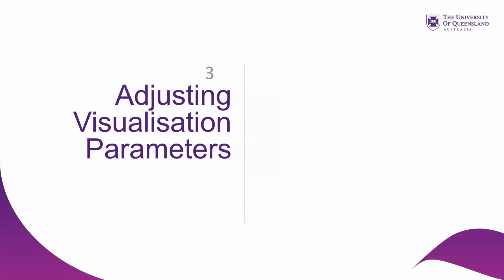The next thing you might want to do once you've got an image open is to adjust the visualization parameters. And that's because, as many of you probably saw, the bioformat sometimes will open it at the full dynamic range, which might be 16-bit. So you've got a lot of gray values, and it will appear really dark on your screen.